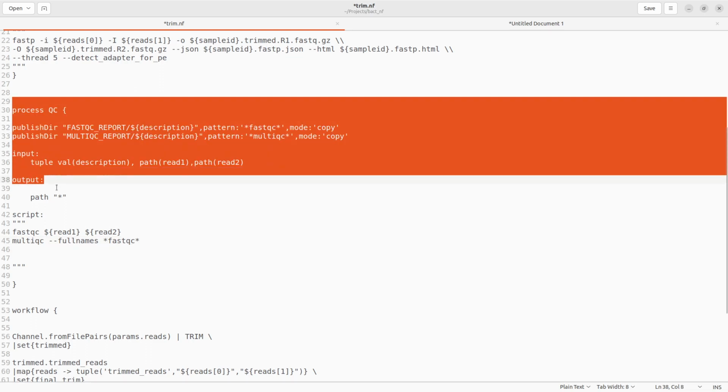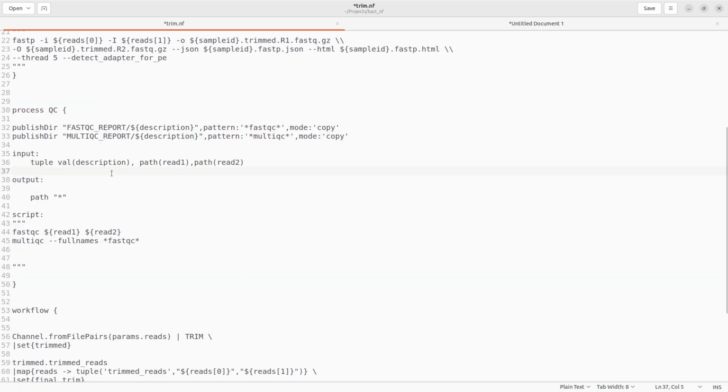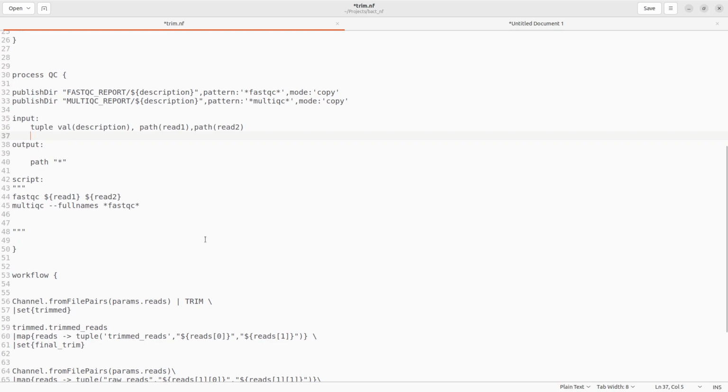So everything has been factored in here, and I'm going to explain everything very soon. All right, so let's proceed. Okay, so we will shift to the terminal and then we will continue. There are things I need to explain to you first and then we can proceed. So we now know what we are going to do, so we are going to proceed.